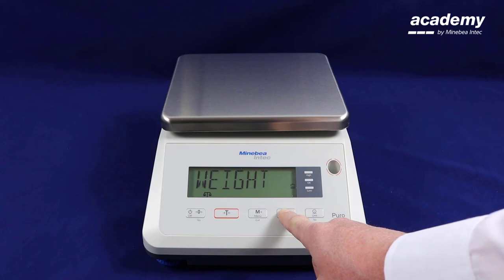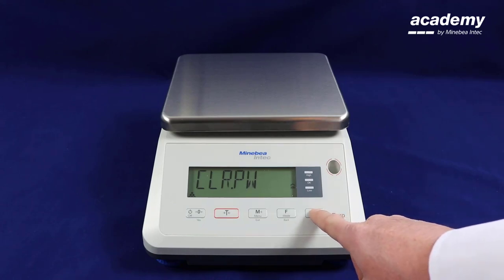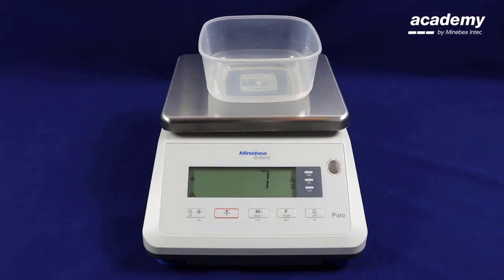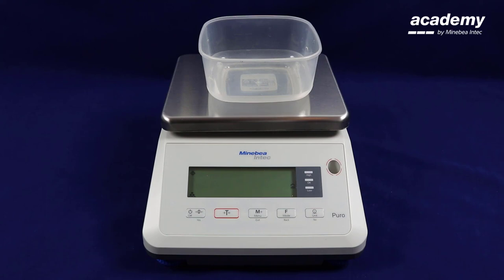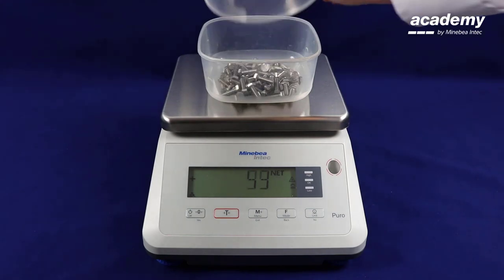Press and hold the function key to return to count mode. Instead of pressing yes to accept the piece weight or clear the piece weights, you can press no. Place the container on the scale and press tare. The scale has stored the previous reference weights.